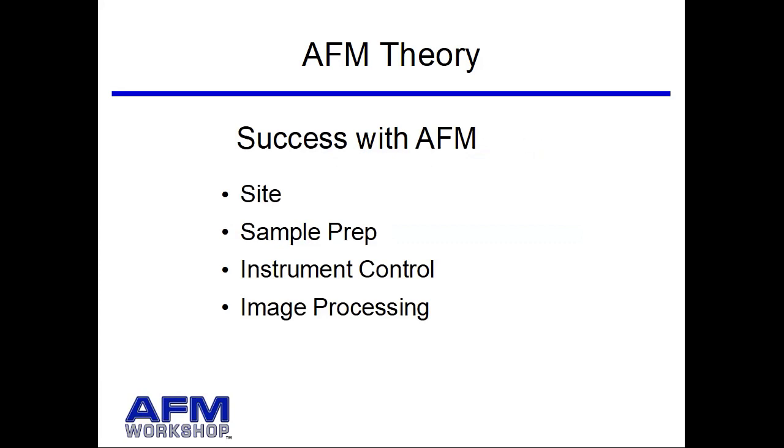So just to go through something here, what does it take to be successful with an AFM? Just follow these 4 simple things. Number 1, find a good site. AFMs love basements. They love small rooms with no fans.